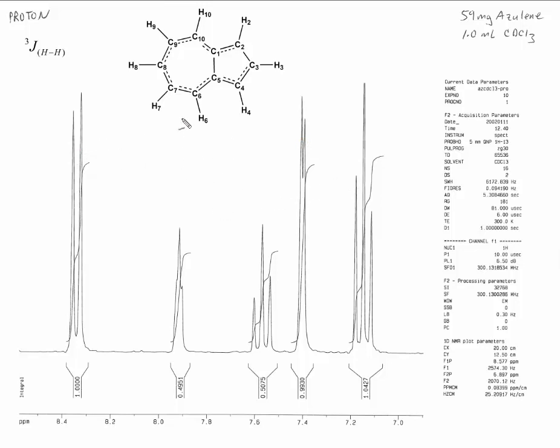So the larger one would go with the pair H6-H10, because the splitting here between this proton and the one that's 3 bonds away, because this ring is open, this distance here will cause the splitting. There's a direct relationship between the distance between the neighboring proton and the value of J, and this will cause this to be a greater value.